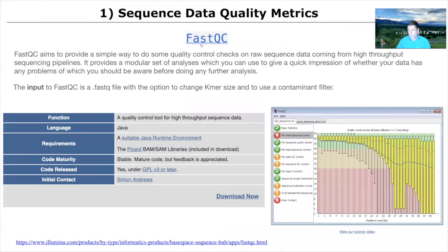And that's the first step, FastQC. If you were following along with the tail of the Nextflow output, you saw this was one of the first things run. It's basically saying how well the quality of your bases was at different read lengths. And you'll notice that if you have homopolymers of all A or all T, G, C, you'll see really bad quality score metrics because the camera can't read that many dots at once.